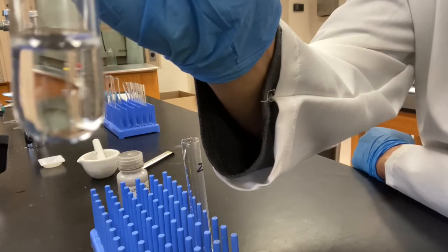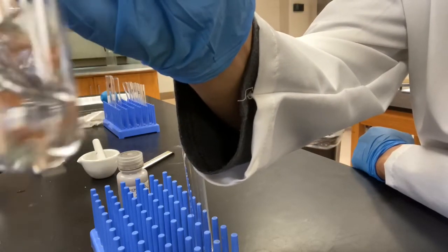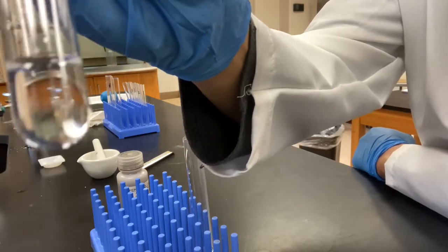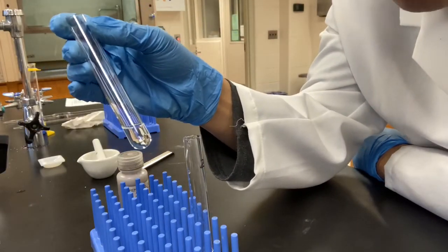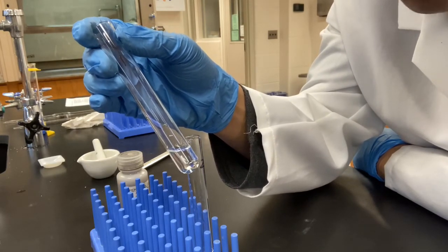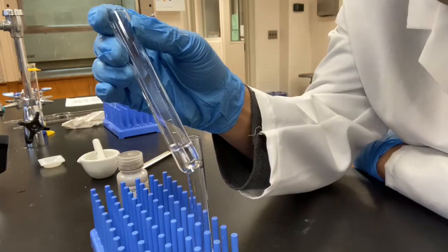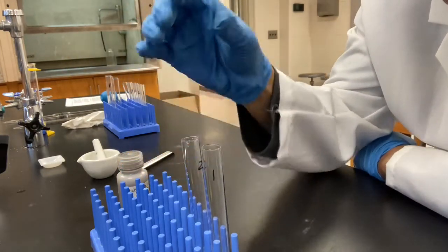Well, I can't. I do not see any bubbles at all. So that tells you hydrogen peroxide is not decomposing by itself, or the reaction may be so slow that we cannot observe the bubbles.